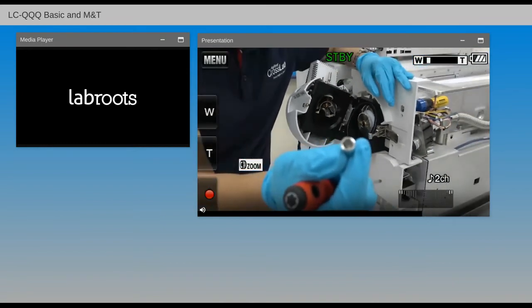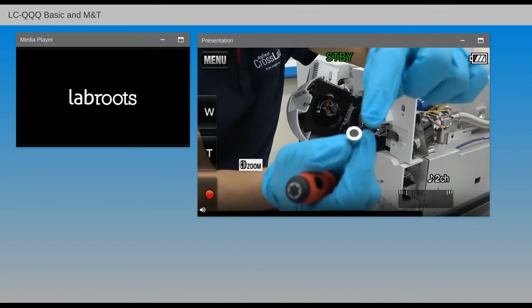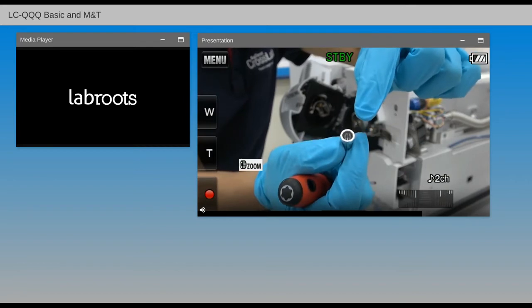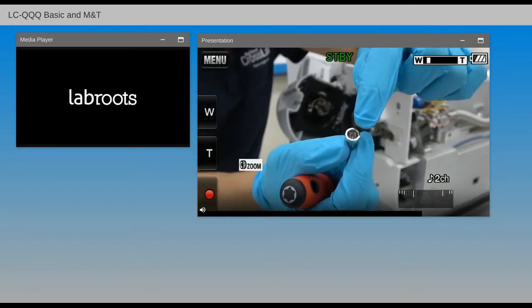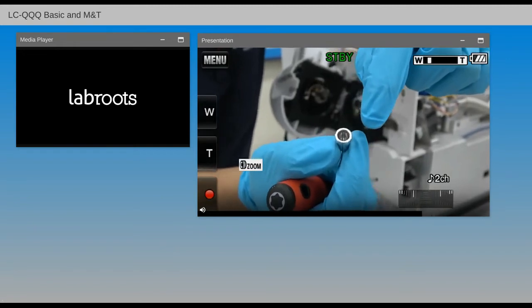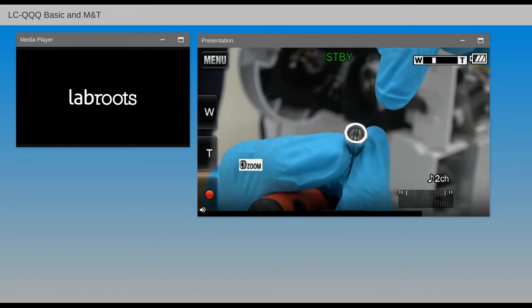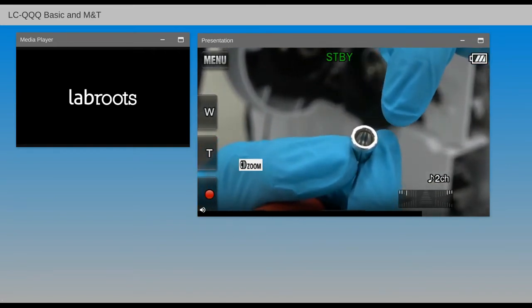Within the cap, there is in fact a canted coil gold spring. The gold spring should typically be in good condition, but if it's ever found to be distorted, it's time for replacement, right? It is a small gold spring right within it.